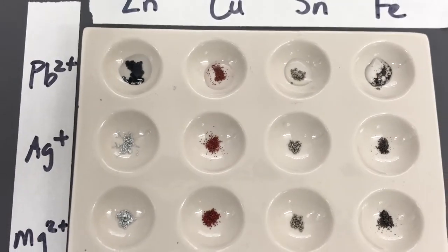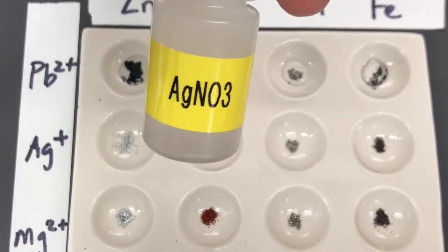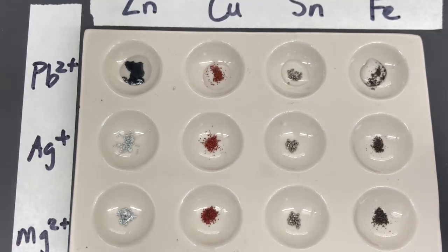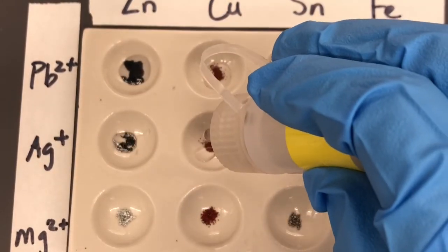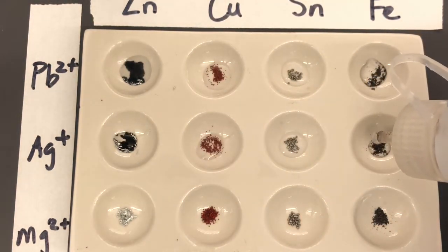So now that we've done lead 2+, we're going to move on to adding some silver nitrate. You'll notice that silver is the only cation that we're adding that has a +1 charge. So we're going to go through and carefully add the silver to each of these species. Silver 1+ is very reactive, can stain your hands black if you were to touch it, so I put some gloves on for this. I'm going to go through one at a time and add a drop or two of silver 1+ to each of the metals.